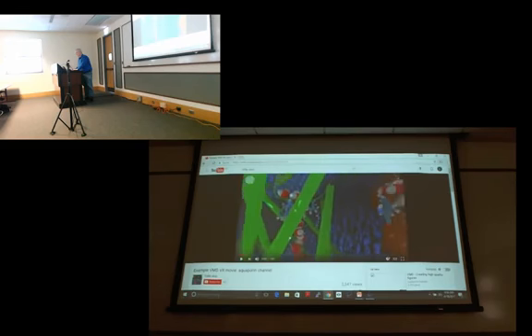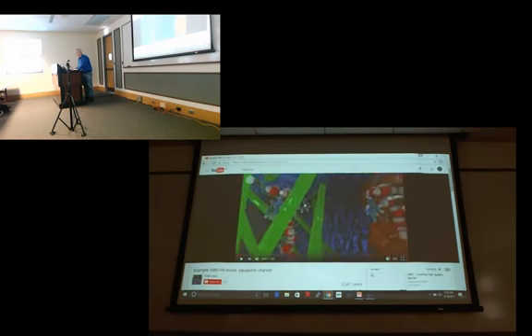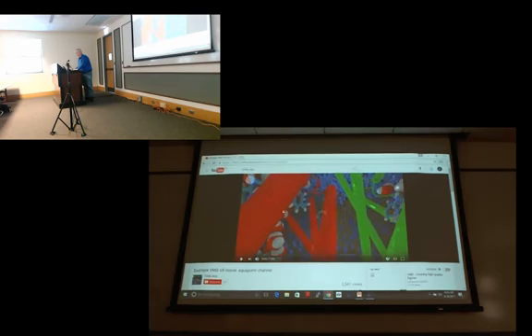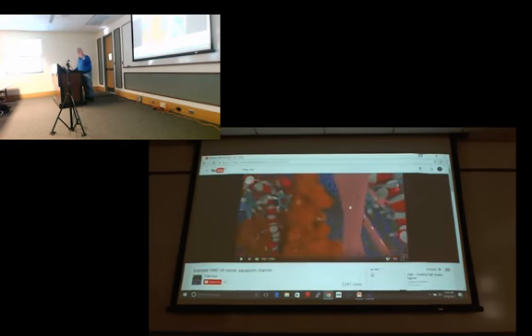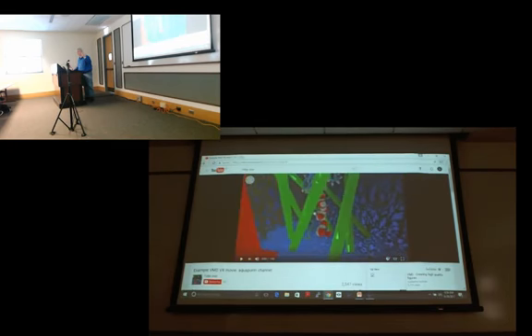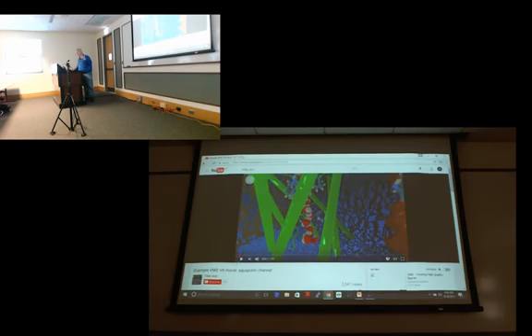Even for a still frame in that movie, you can see I can use my mouse and look all the way around. And that's pretty cool, because that gives you the ability to show somebody a three-dimensional rendering of your molecular structure. And in fact, if YouTube would cooperate here, we'd be able to show you a moving structure.